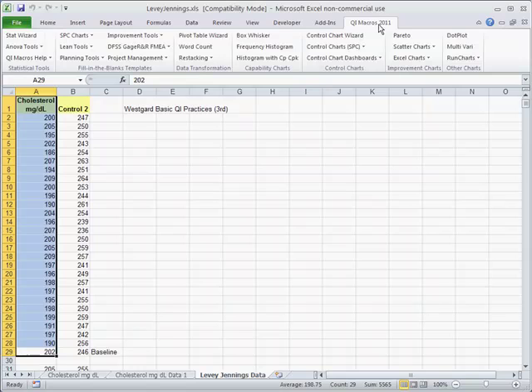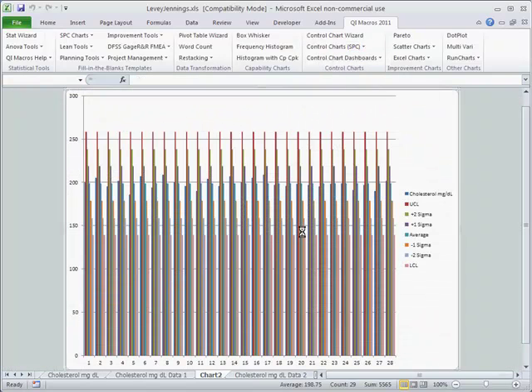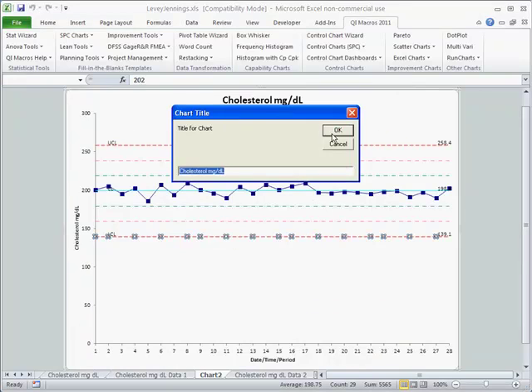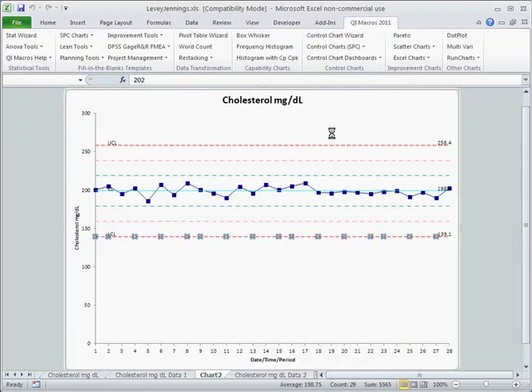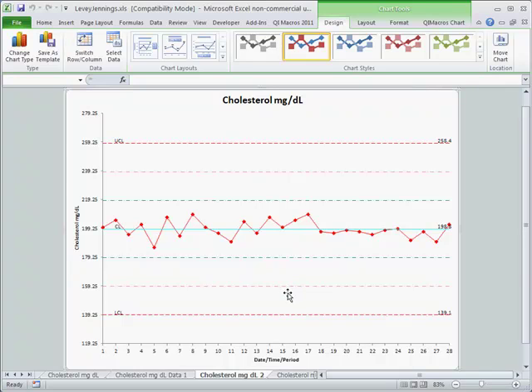We could also take that data and do the Levey-Jennings 10% chart. It will calculate limits that are 10% away from the center line. You can see that all of these are hugging the center line, so maybe that wasn't the best test.